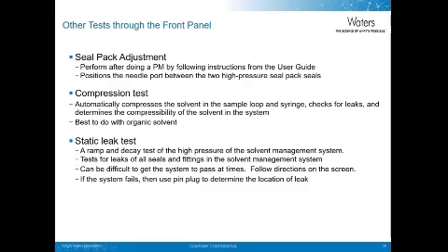Next is the static leak test. This is a ramp and decay test of the high pressure of the solvent management system. This tests for leaks of all seals and fittings in the solvent management system.